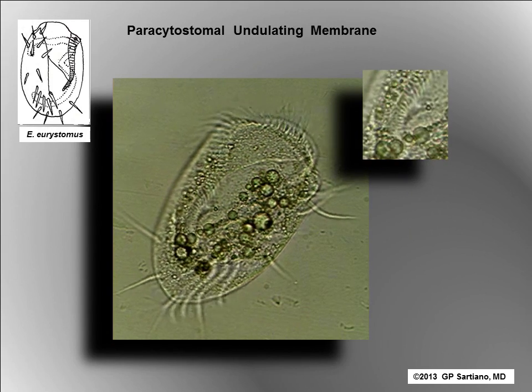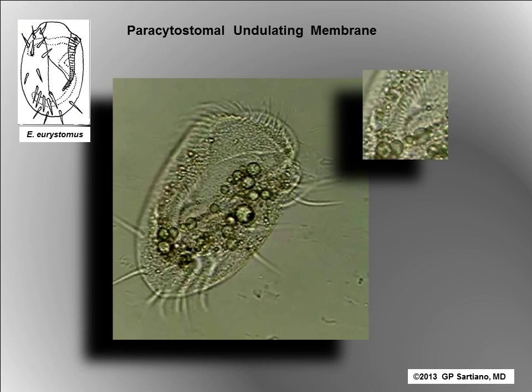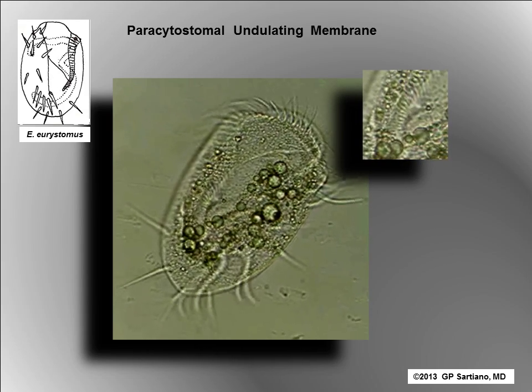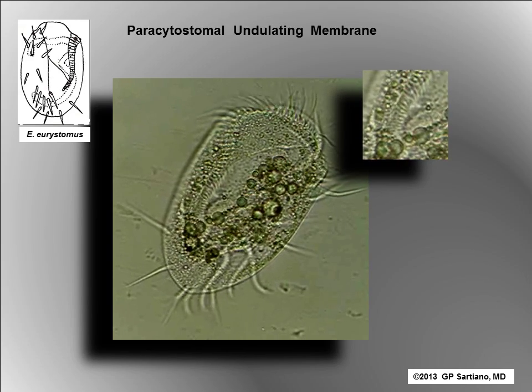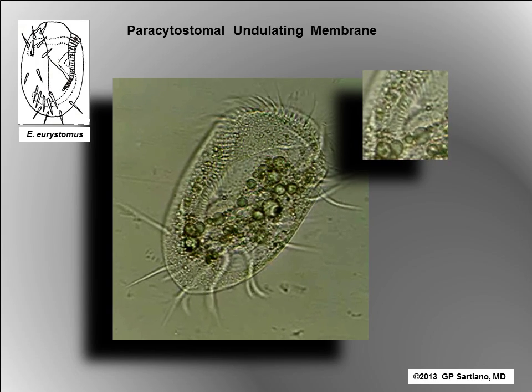In the inset view here, on the observer's upper right, it can be seen that the membrane is quite delicate and that it overlaps the distal AZM, with which its movements can be confused.